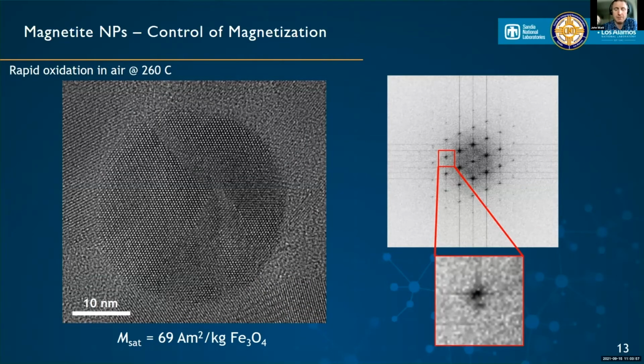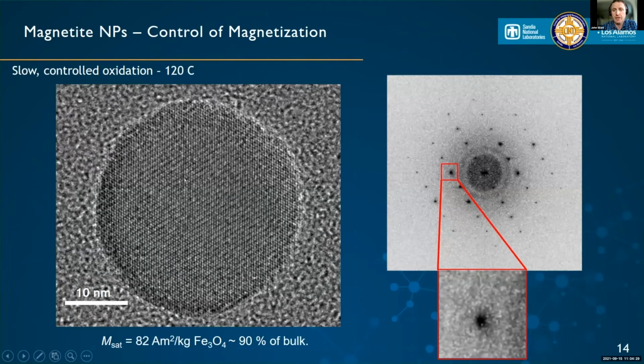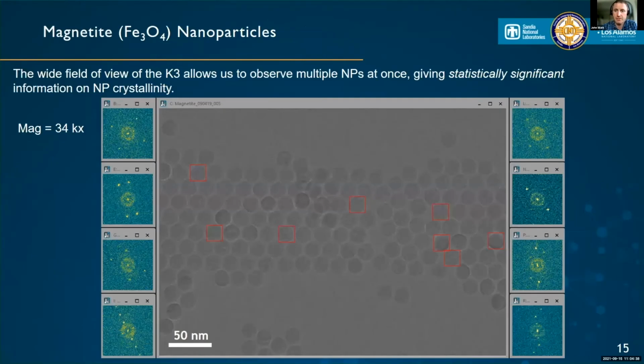And what Dale does is he makes wüstite first, which is FeO, and that's how he gets the really nice size distribution, because there's no magnetic interactions happening in the synthesis. And then they oxidize them in air afterwards, like a post-treatment. And they found that if they do it really fast, they get the introduction of defects, multiple oxidation sites nucleating at the surface. And so you can get a lot of defects happening in rapid oxidation. And if it's very slow, you get a really nice single crystal of magnetite and your MSAT starts to approach the bulk. So this is another thing that we wanted to watch in situ and see if we could track some of these things happening.